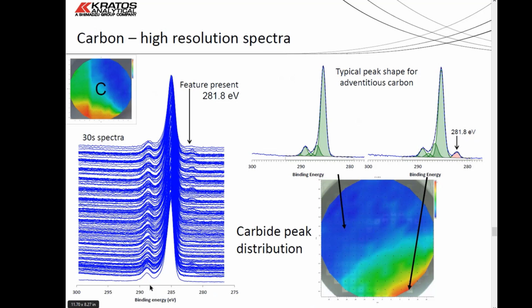It's great when you do these kind of experiments because you end up with so much data as well. You can really dig into it. We tried to do an intelligent data system kind of thing as well, where you could just feed the data straight into a program, which she had with XRD, and it will just spit out what the results are. Problem is XPS data is really horrible, and there's loads of weird features and backgrounds and stuff like that to deal with. So it wasn't simple.